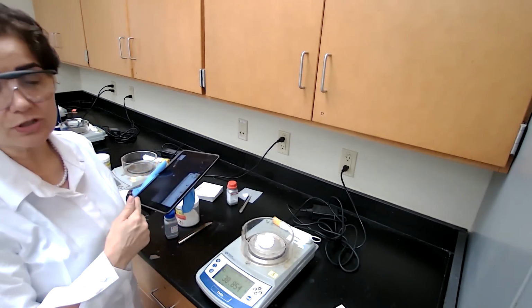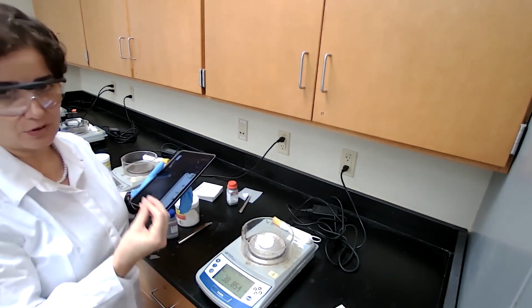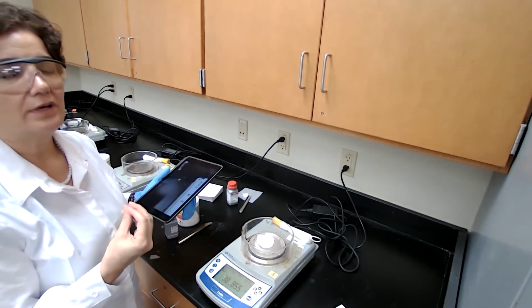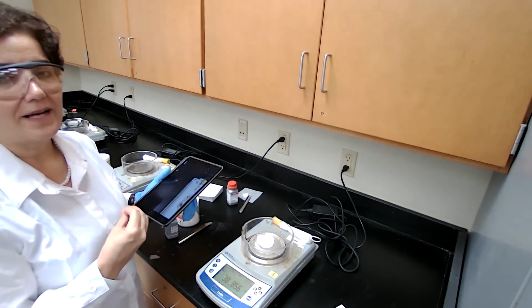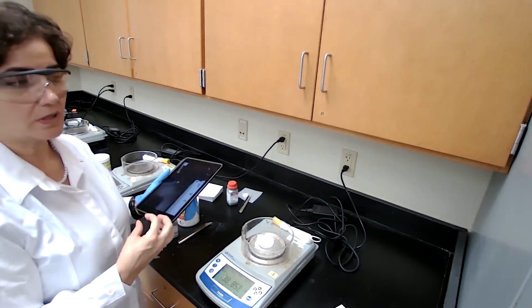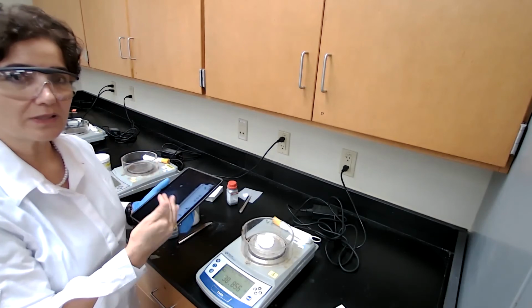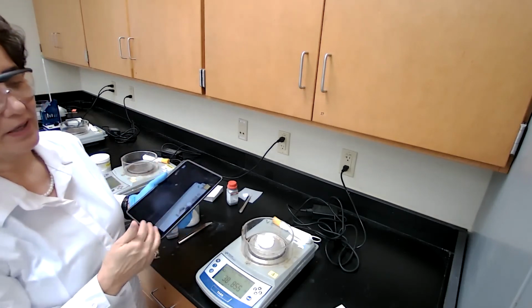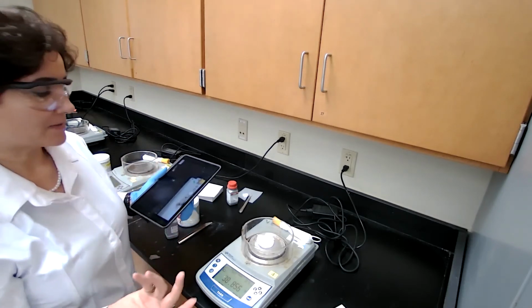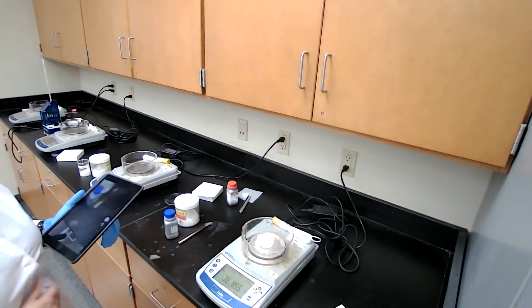Same thing for the neutral compound. When you find the actual mass of the recovered neutral compound, you are going to record that mass, divide by the initial mass that you started with, which was about 0.5, times 100 to get the percent recovery of the neutral compound.